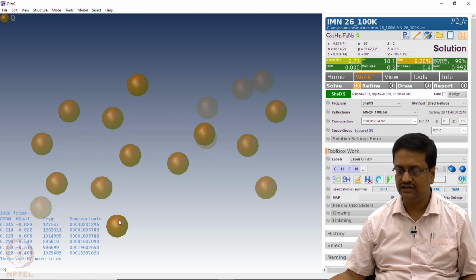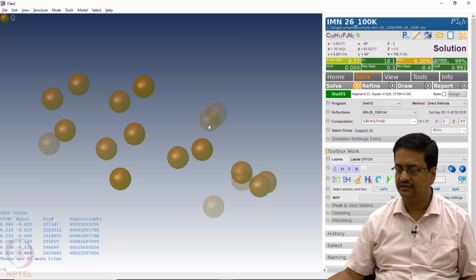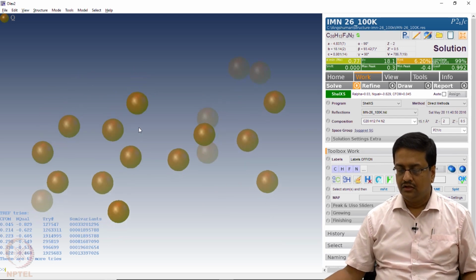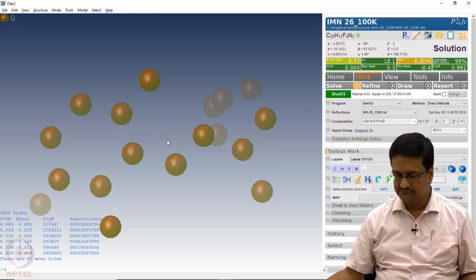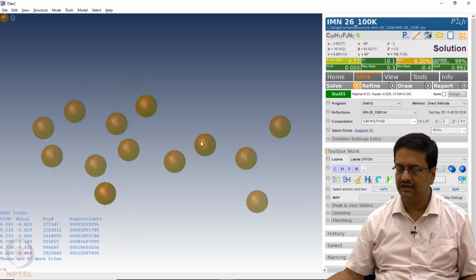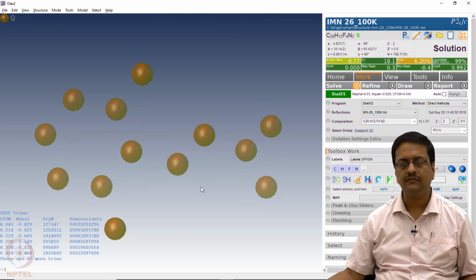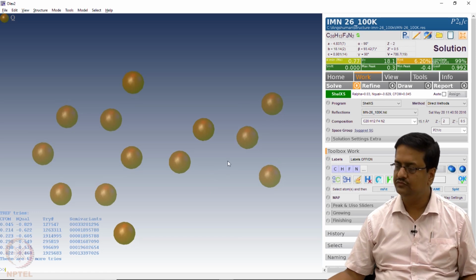We can see there are some brown spheres with a brighter intensity and some of them are of weaker intensity or feeble spots. Those are of very low electron density and the others are high electron density. So we can remove the low ones by scrolling and we have only a part of our molecule. Now, let us assume that we don't know what the molecule is.